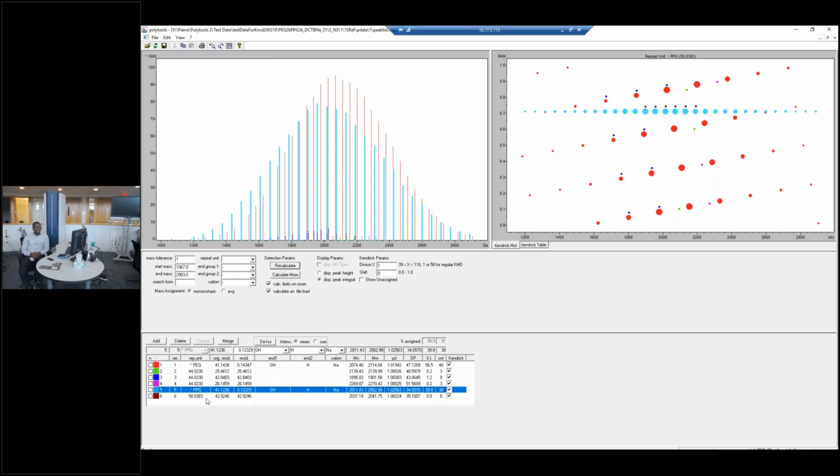That it depends. Normally, using the sample prep methods that I've shown, there shouldn't be any issue in the ion source. But there are some requirements that we have to abide by, especially for insoluble samples or polymer surfaces. It can't be something too thick. For example, you need a sample that's at least 5.5 millimeters or less in thickness. Anything bigger than that will definitely defocus the laser and damage the instrument.